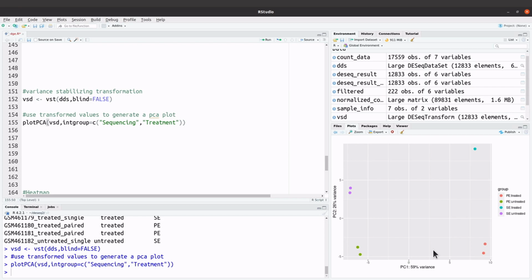Batch effects, which can be a hidden effect or an unwanted variation, are possible to correct. You can correct for this when using DESeq. If you know that you have samples that can influence the results, or that can lead to batch effects, then it's possible to correct for this by including any known bad variables in the design. That's something you have to look at.